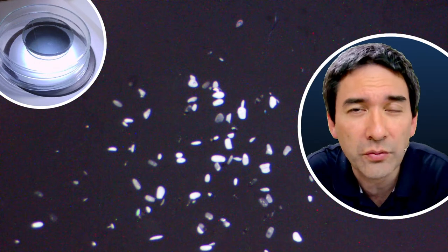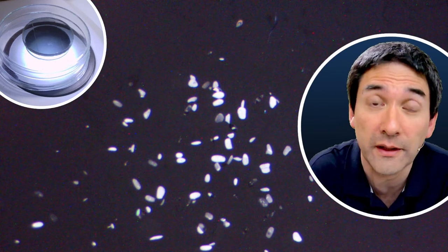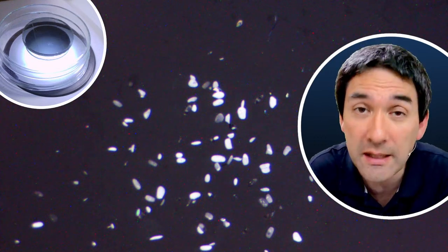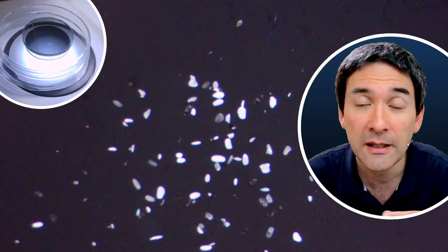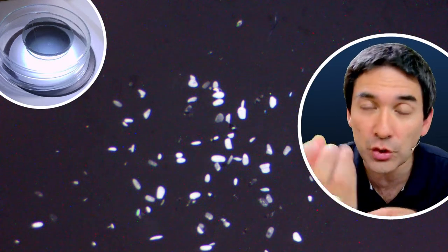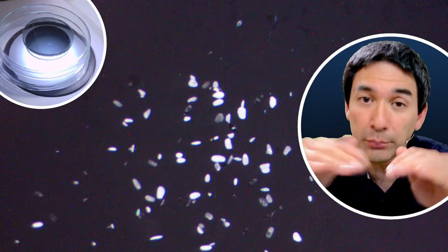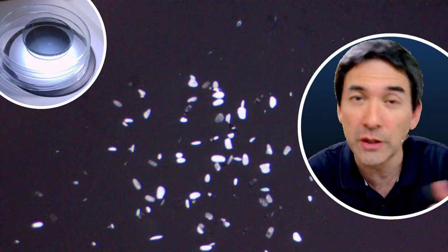I think I made one or two videos on how to actually put ice crystals, snowflakes, as a matter of fact, under the microscope. What you have to do is you do not observe the snowflakes directly, but rather the impression that the snowflakes make on clear nail polish. So what you do is you take a microscope slide and you put some ice cold clear nail polish over it, and you catch some snowflakes, and the snowflakes will make an impression on the clear nail polish, and when the clear nail polish dries, you have an impression of the snowflake, and then you take the impression and put it under the microscope.